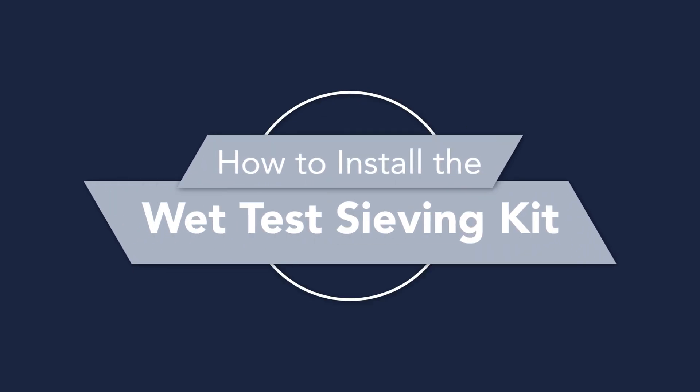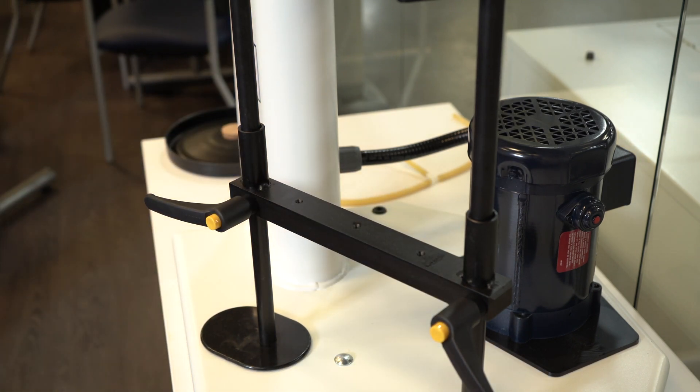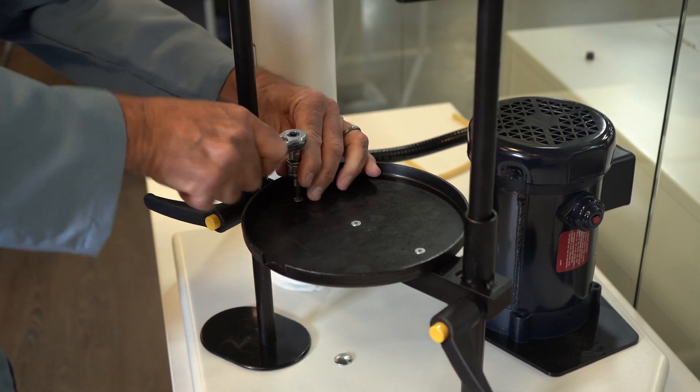How to install the wet test sieving kit. Step one: remove the standard issue sieve support plate and replace it with the modified sieve support plate and bottom pan with the spout.